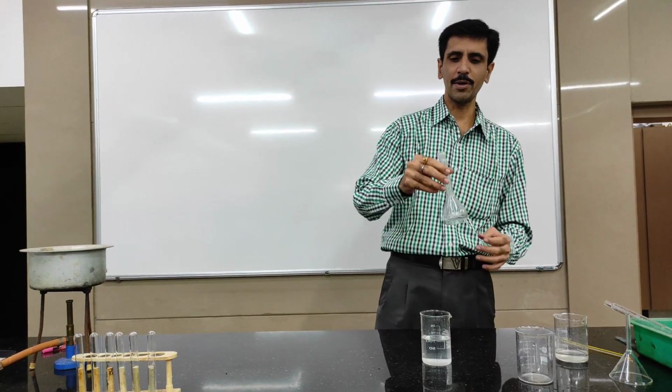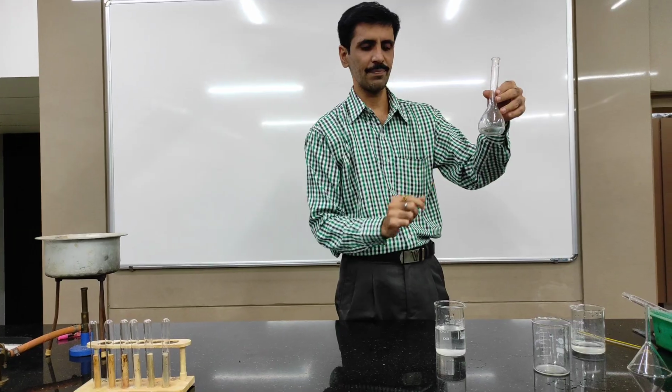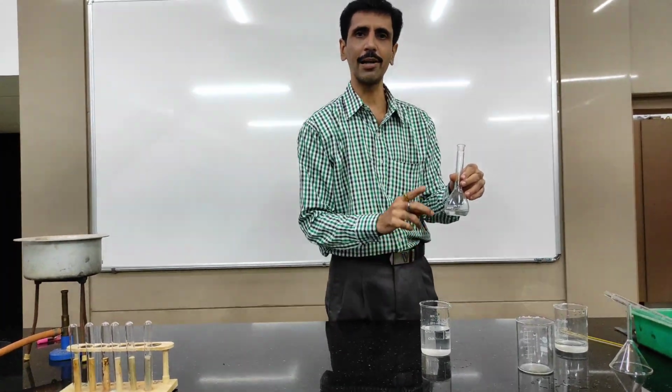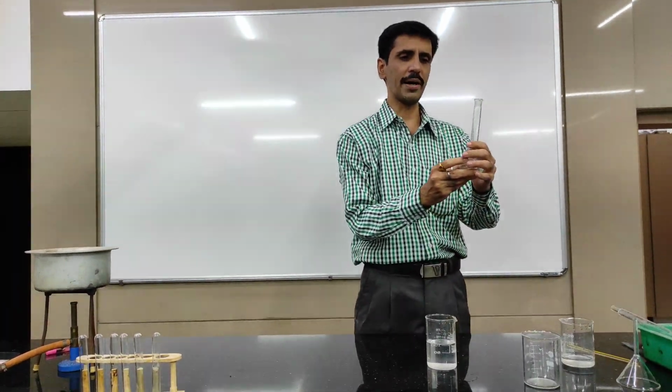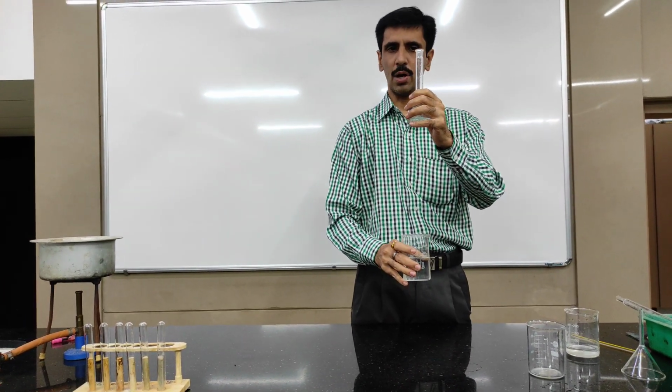Now we actually start with this experiment. We start with a practical demonstration, my dear friends. This is the given solution of sodium sulfate. The first step is that we are going to dilute it with distilled water up to 100 ml. So let us hold this standard measuring flask to our eye level.